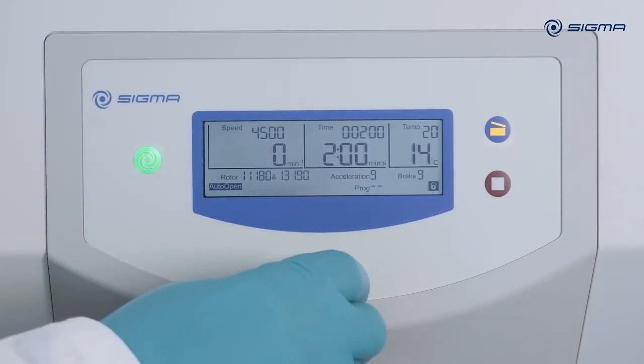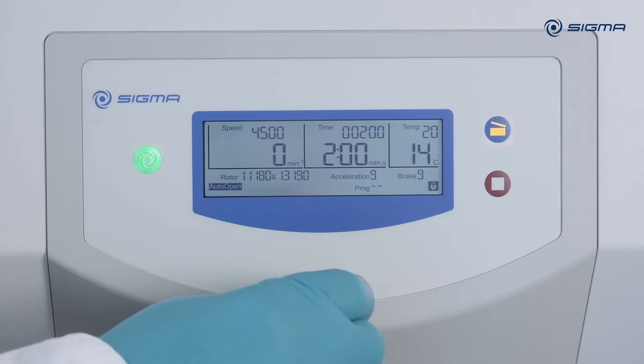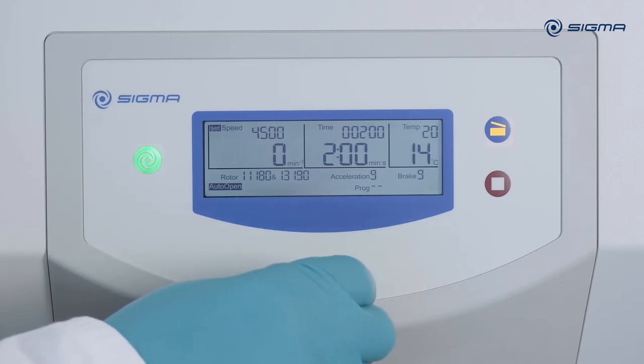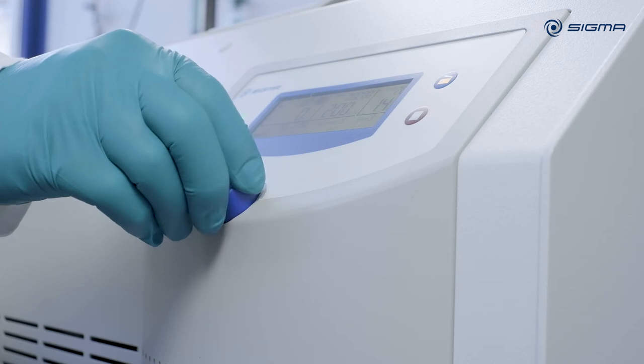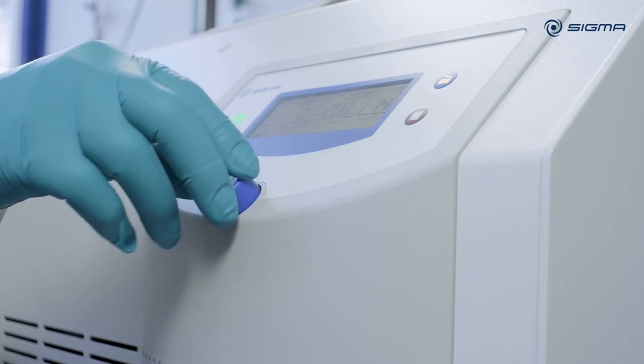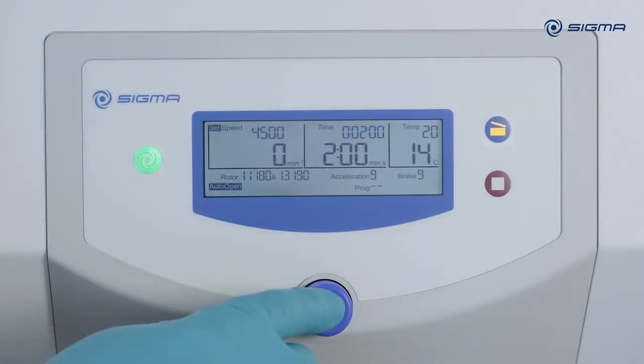All settings are made using a single central knob. You can turn the knob left and right to navigate to the individual menu items. Press the knob to enter setting mode and make settings. All settings can also be changed during a run.